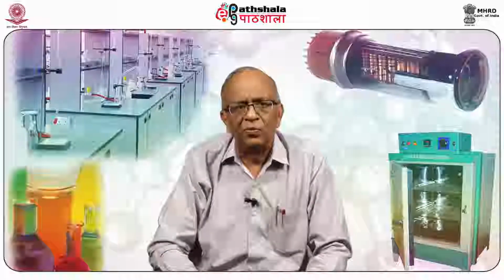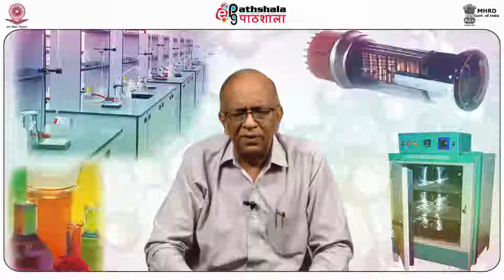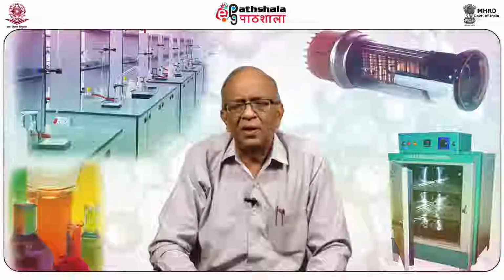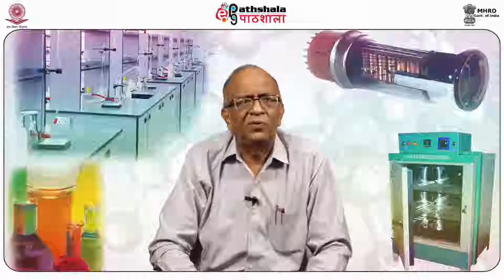Today we are going to discuss a module, Thermoanalytical Chemistry Part 1, under the paper Fundamentals of Analytical Chemistry. As the name implies, it is simply the effect of temperature. We are analyzing the effect of temperature.